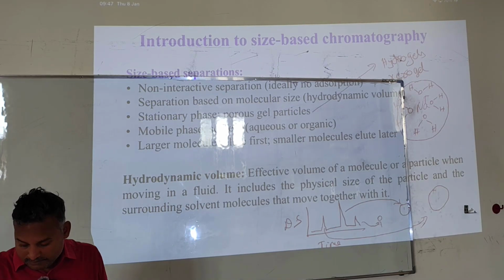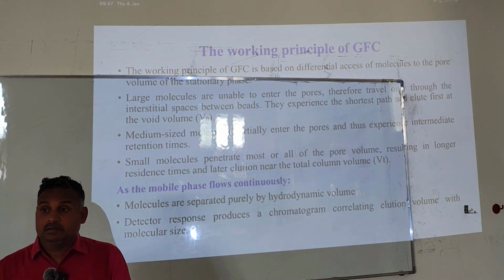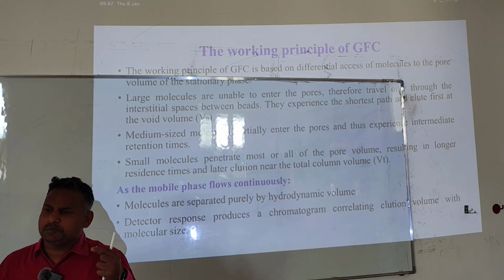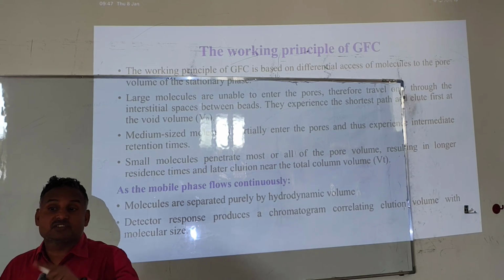Now, working principle of GFC, that means gel filtration chromatography. We have different names for this chromatography. GFC means gel filtration chromatography.